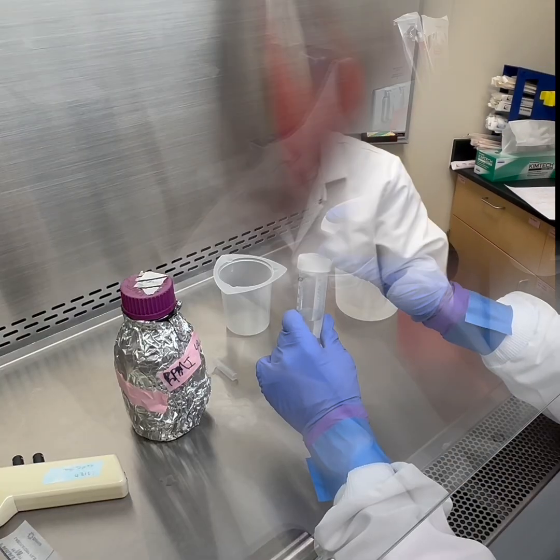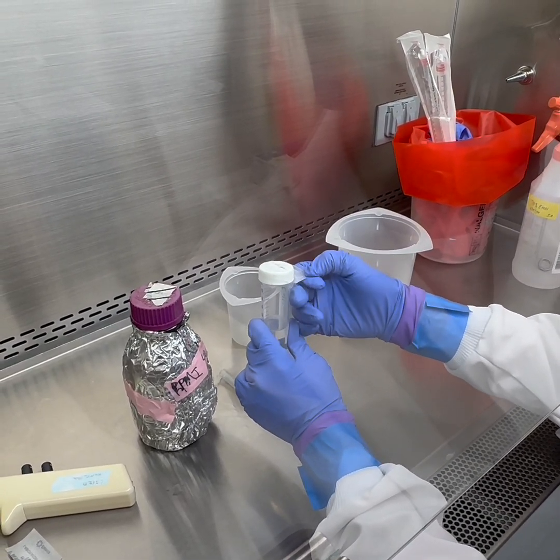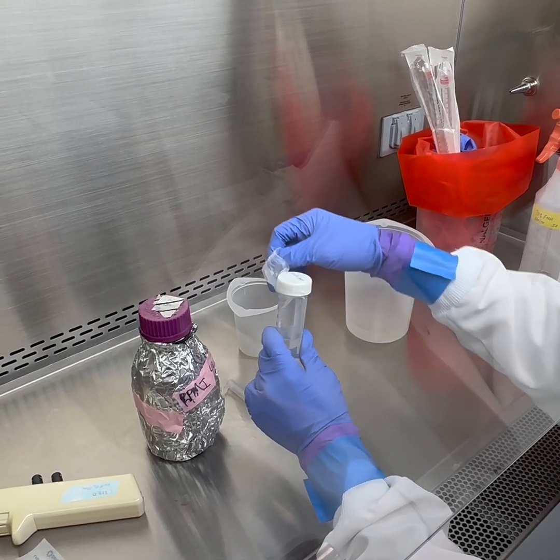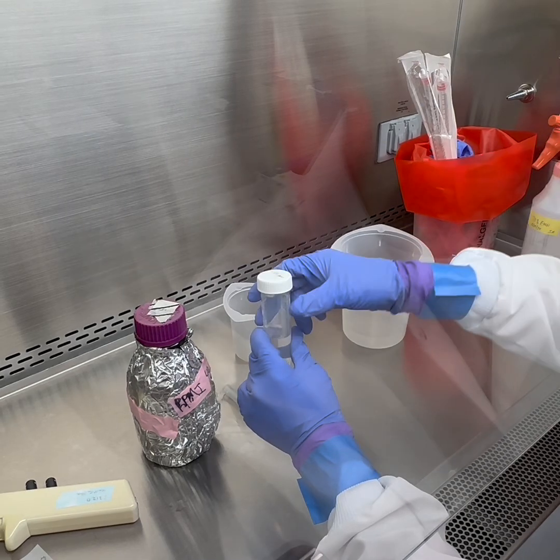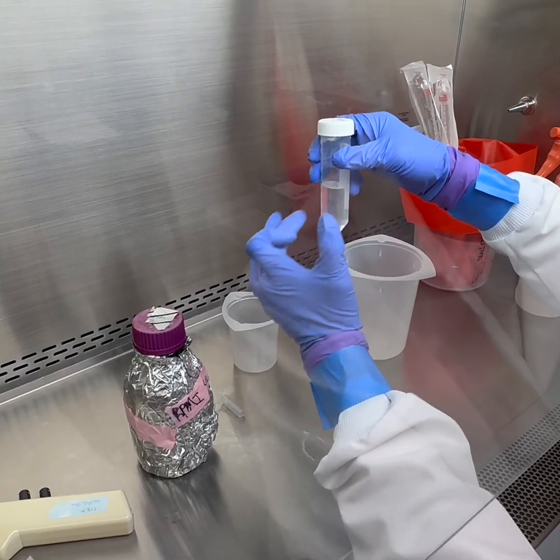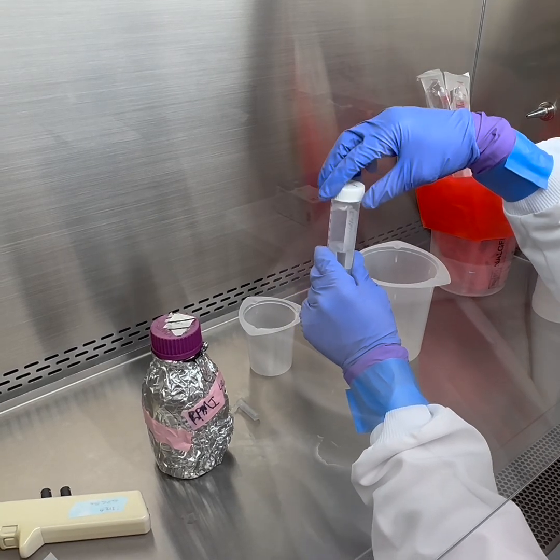Now we'll centrifuge. All right, so we've just centrifuged. Hannah just centrifuged this at 3,000 Gs for 10 minutes. Acceleration and deceleration of 9. This is our last wash. So this was our second wash with PBS.